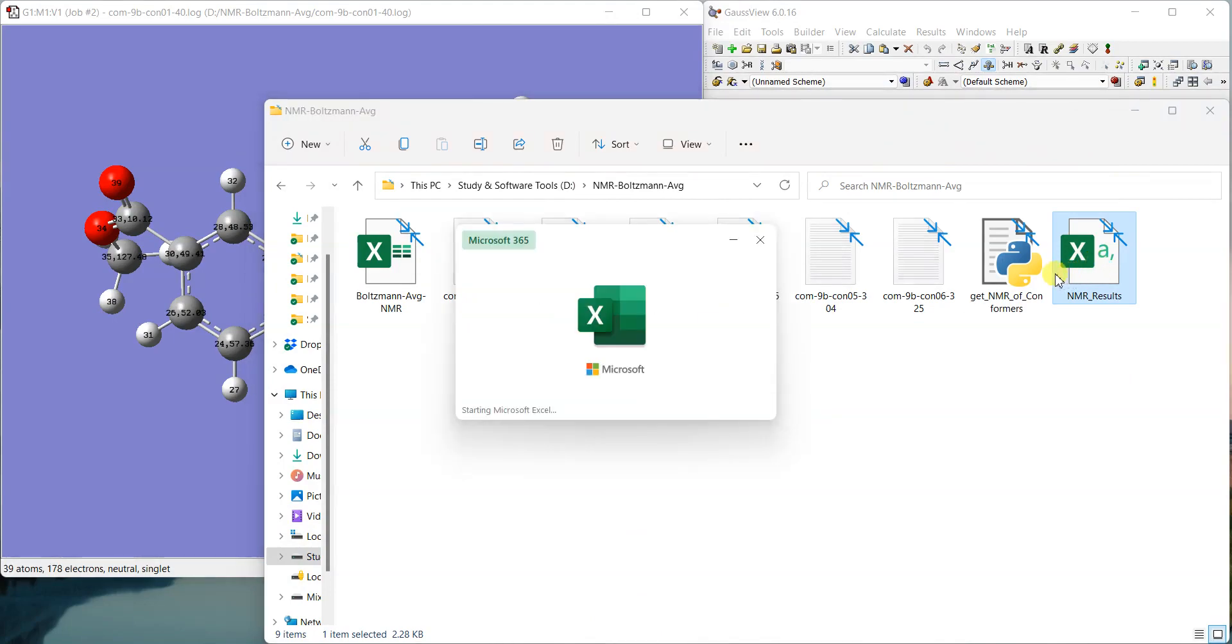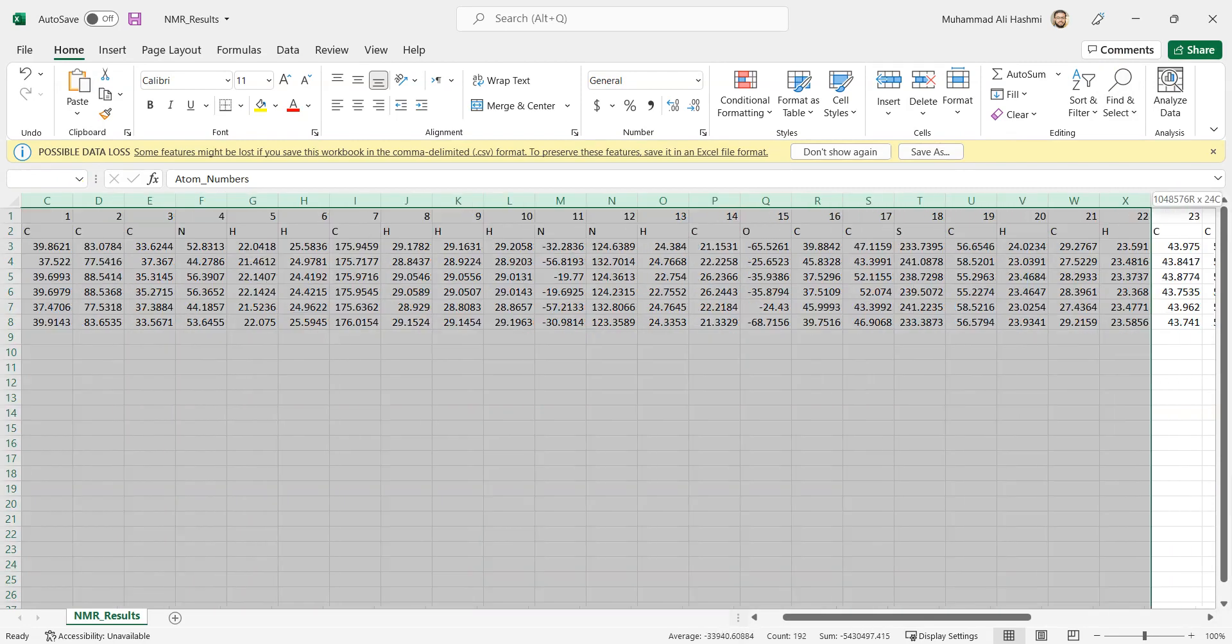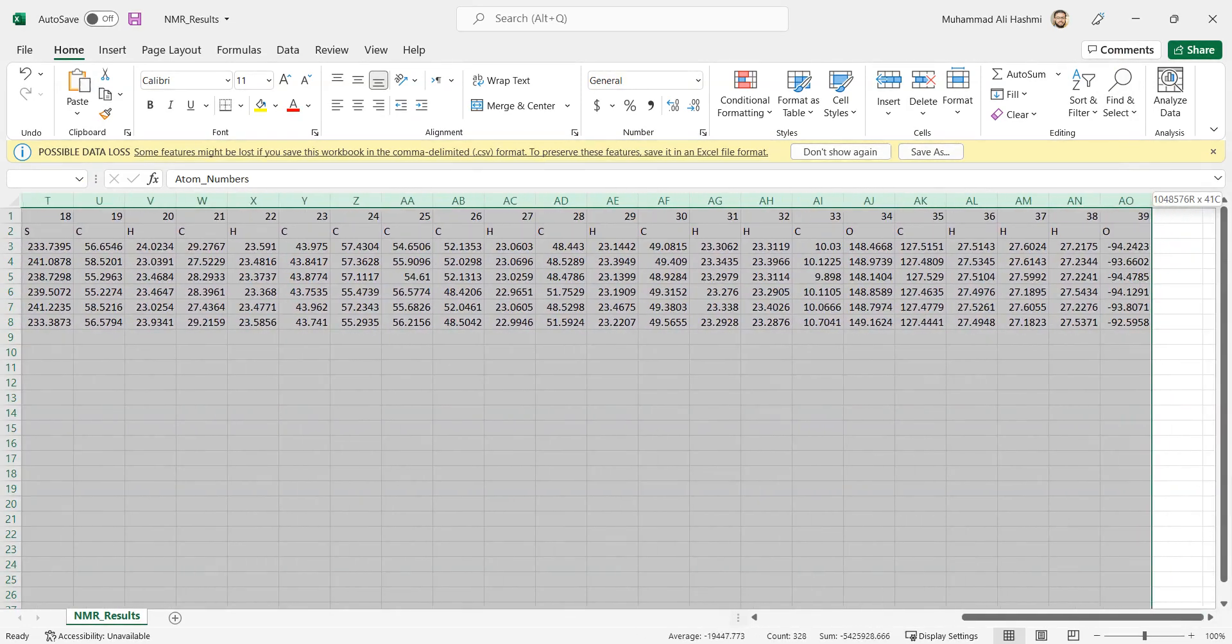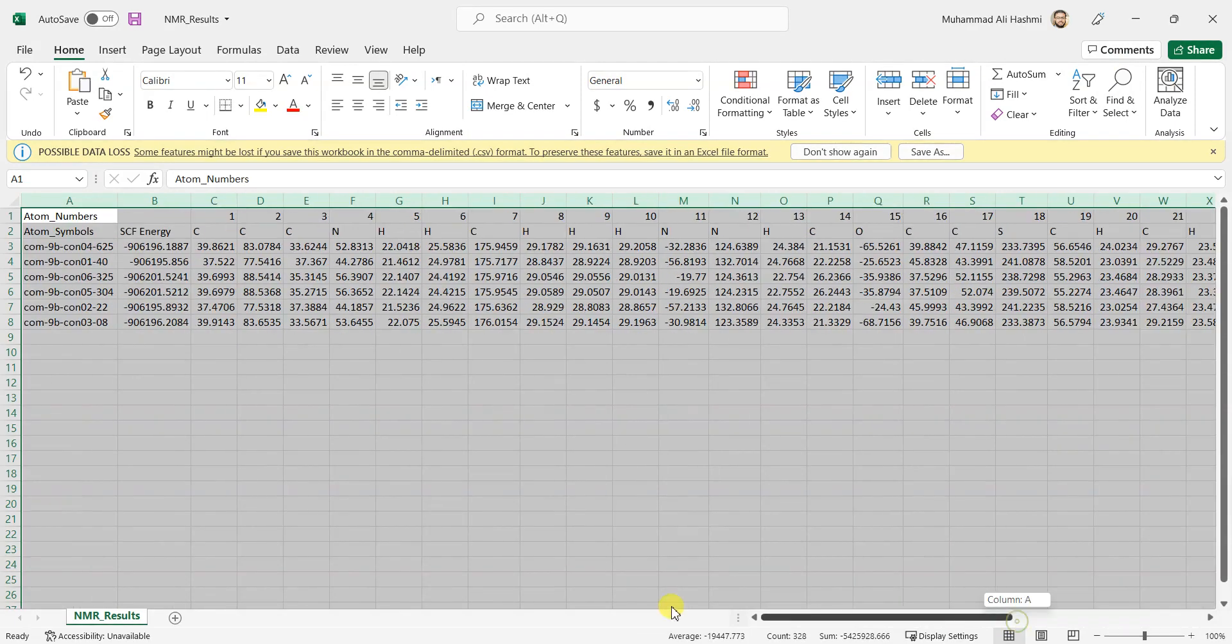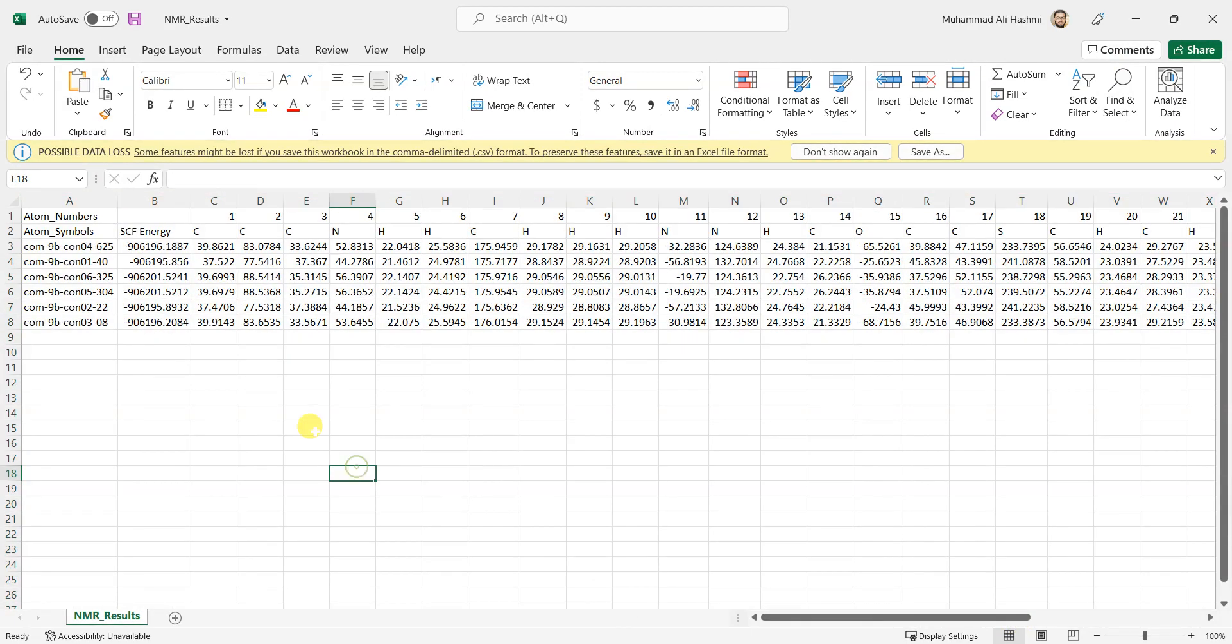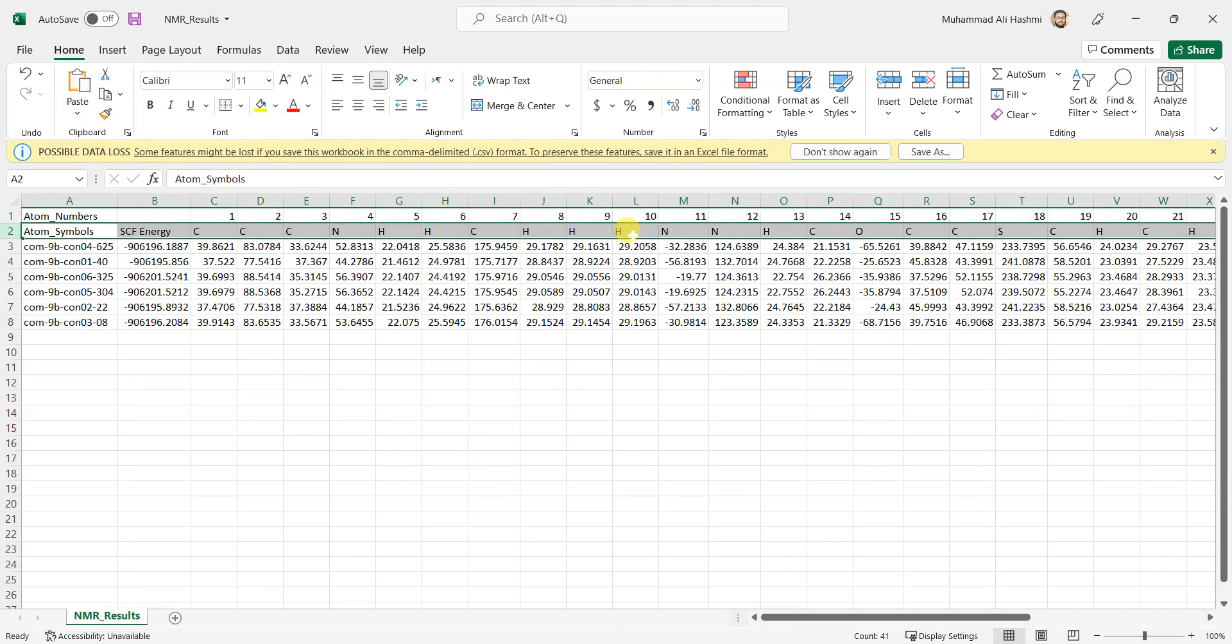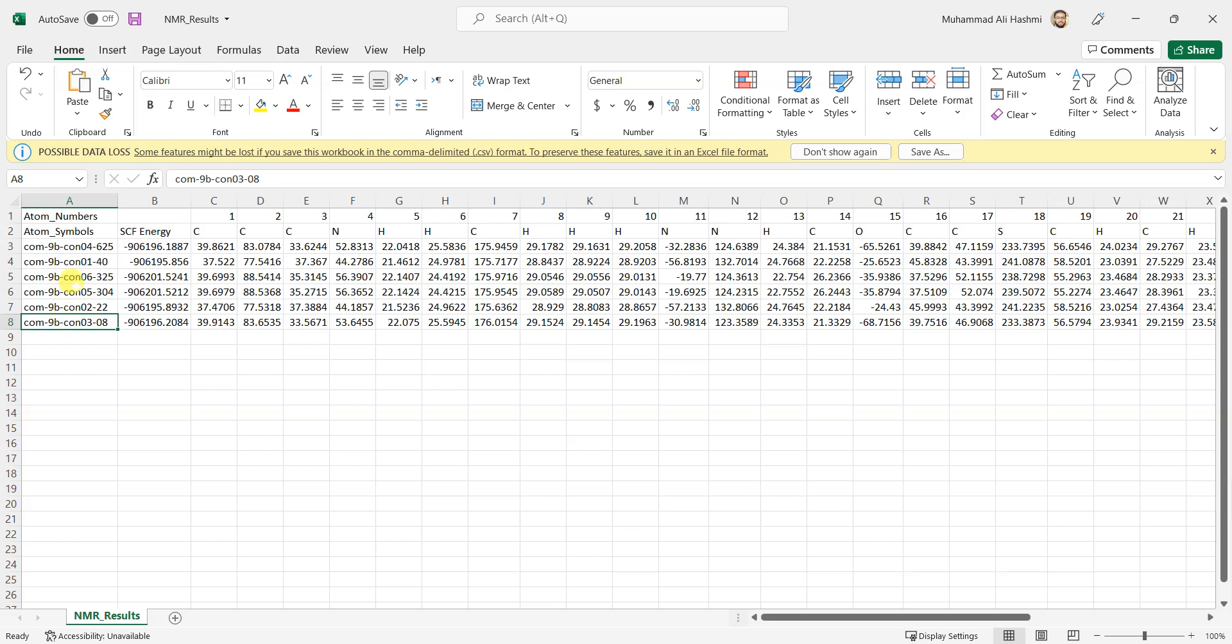Now I have got this Excel file where you can see—I'll just resize these columns so you can have a look more easily. So these are the atom numbers and then here are the atom symbols. Atom number 1 is carbon, atom number 4 is nitrogen, atom number 6 is hydrogen. It gives you all the NMR data. These are the compound names, which were actually the file names, and then we also have a column for their SCF energies.